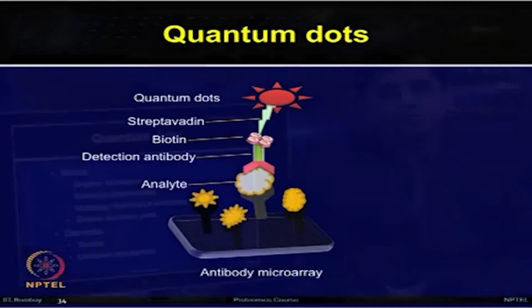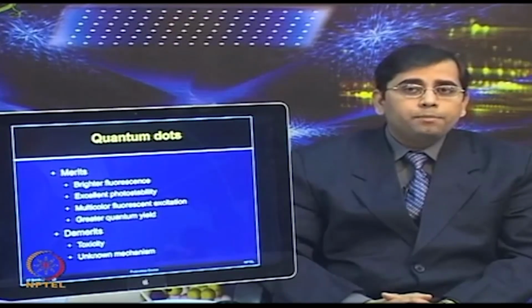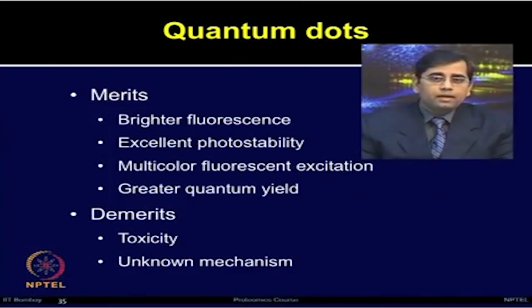The key advantages of quantum dots compared to the organic dyes include brighter fluorescence, excellent photostability, multicolor fluorescent excitation and greater quantum yield.